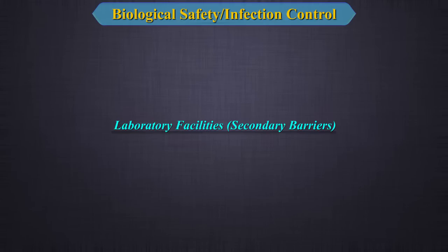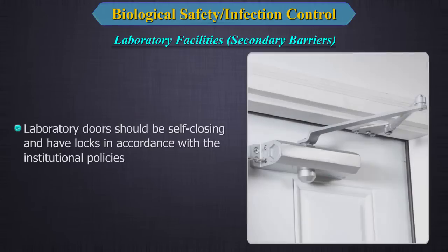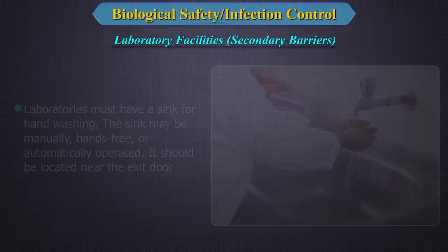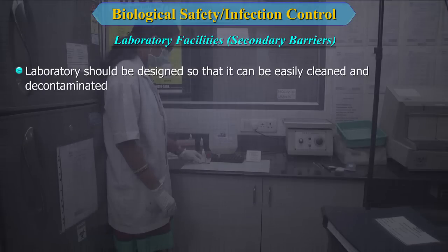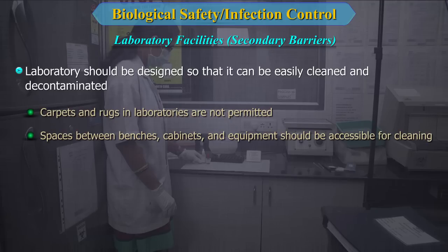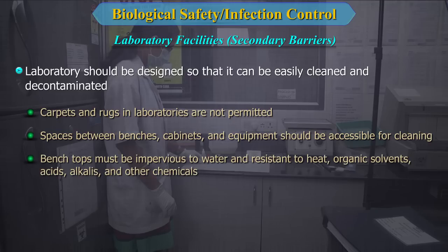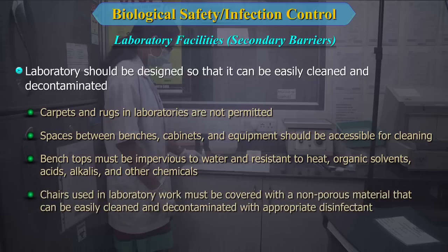Regarding laboratory facilities providing secondary barriers: 1. Laboratory doors should be self-closing and have locks per institutional policies. 2. Laboratories must have a sink for hand washing, which may be manually, hands-free or automatically operated, located near the exit door. 3. The laboratory should be designed for easy cleaning; carpets are not permitted. Bench tops must be impervious to water and resistant to heat, organic solvents, acids, alkalis and chemicals. Chairs must be covered with non-porous, cleanable material. 4. Laboratory infrastructure must support anticipated loads and use.